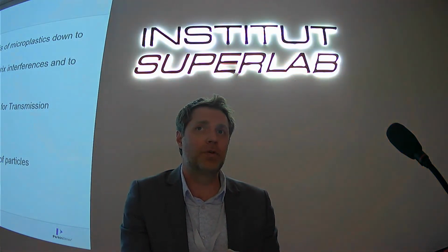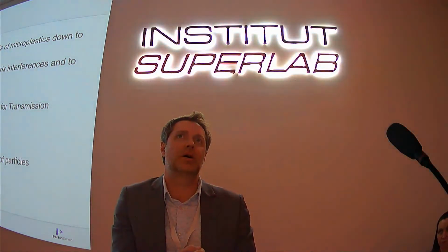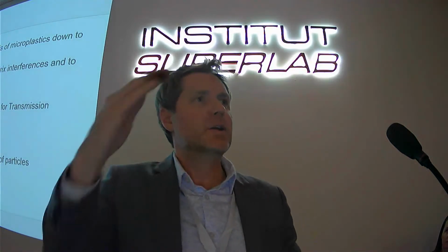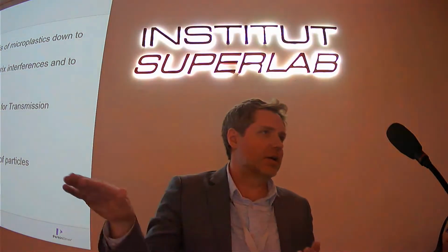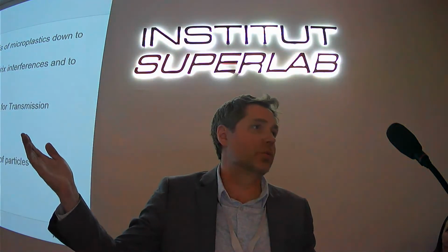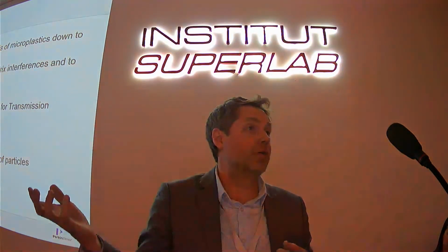But there are people that use different backgrounds. Actually, some people will try to subtract a polymer background to just look at whether there is intensity or not based on one polymer. It's not something we recommend. We generally say a neutral background and then subtract. Once you've done that, the computer automatically does it. Some people actually, you can switch that off in the software.